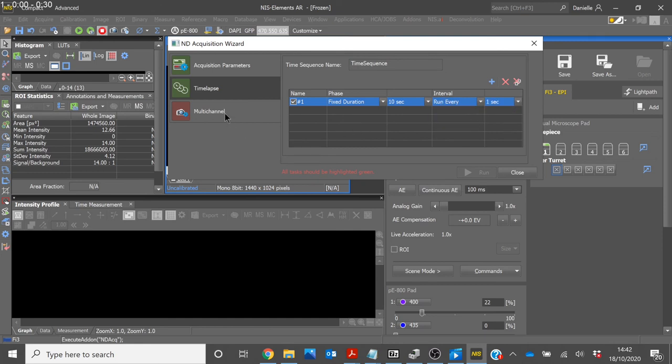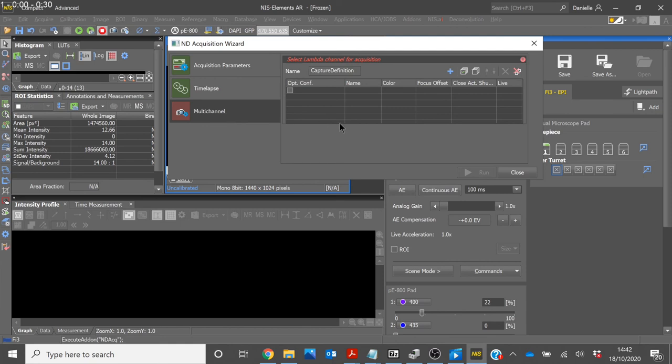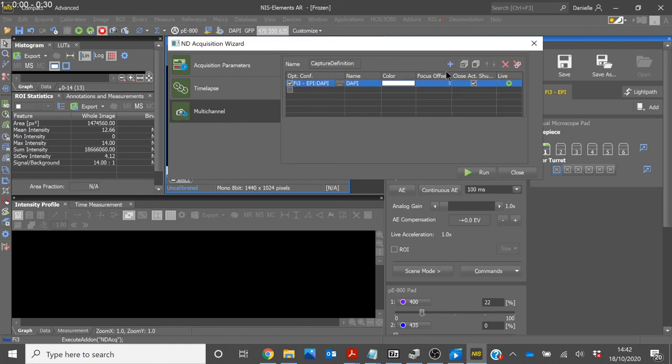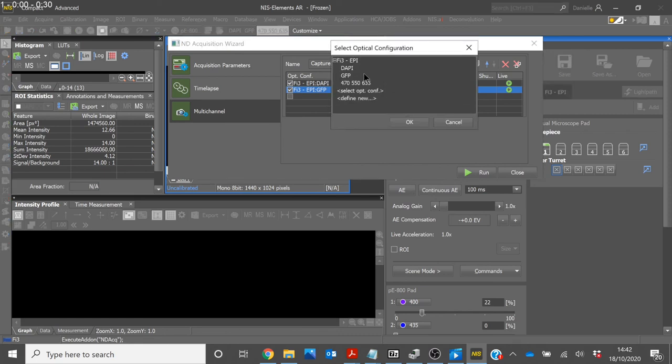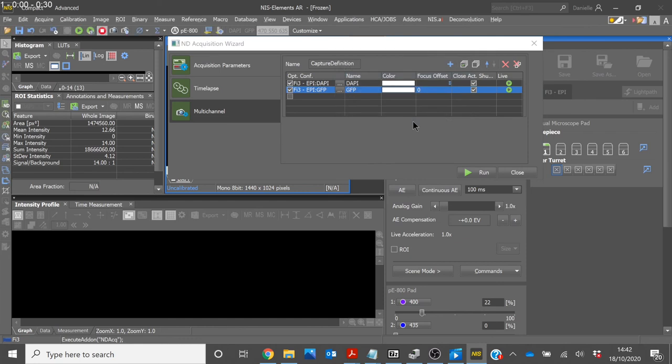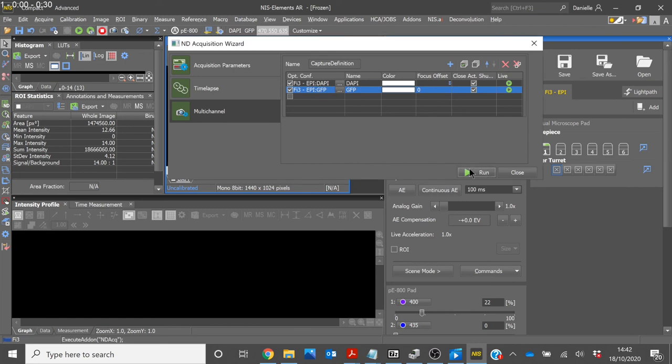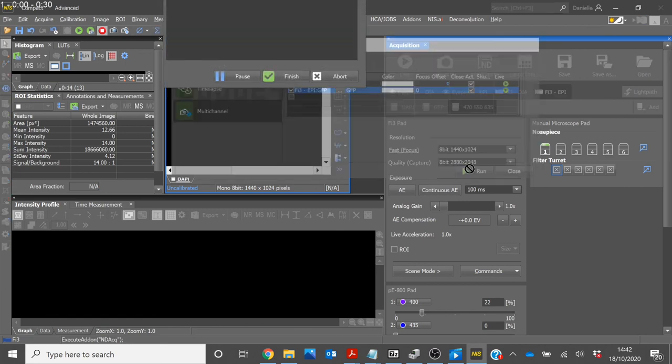Then select Multichannel and here is where you add your optical configurations. You can change the optical configuration by selecting on the three dots. Here you can also add in new optical configurations. For this experiment, we will stick with GFP and DAPI. Once you are ready, you then click Run and your experiment will begin.